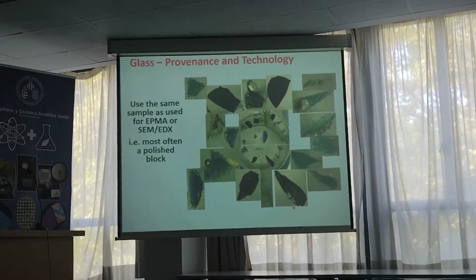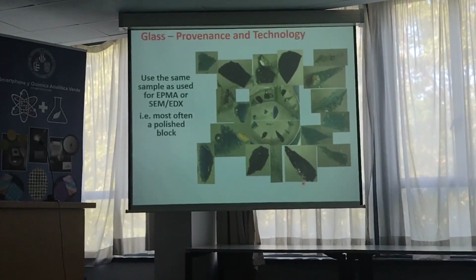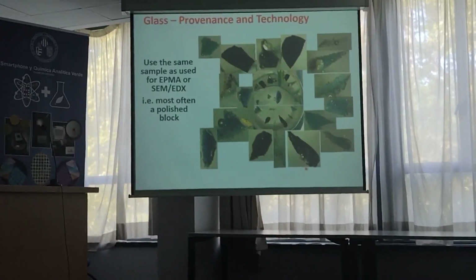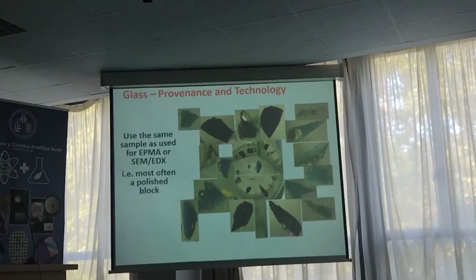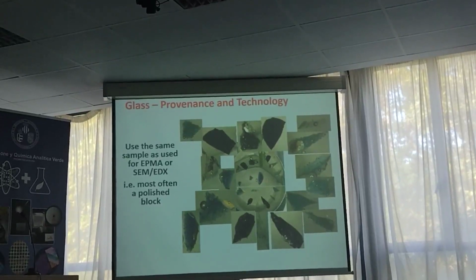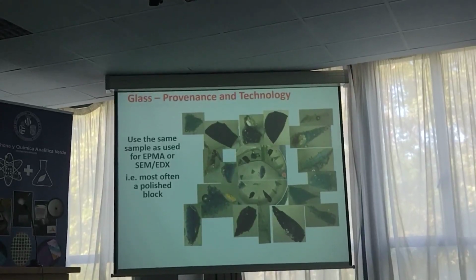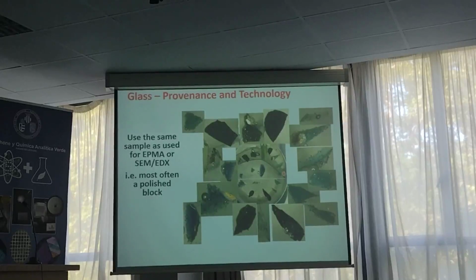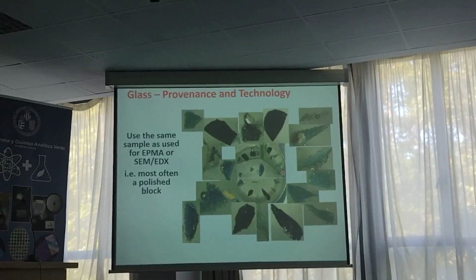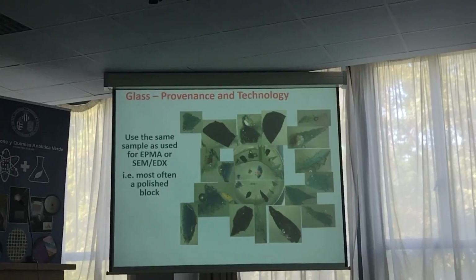Small pieces of glass we can put straight into the laser to analyze, but actually before people were doing much laser ablation for glass, they were using electron probe microanalysis, and SEM and EDX, for which you need a flat sample. So here in the center we see a piece of plastic where there are some small pieces of glass embedded, and people get very skilled at just flaking a very tiny piece of glass off a larger piece, embedding it in the resin and polishing to a flat surface. And actually this is ideal for the laser as well.